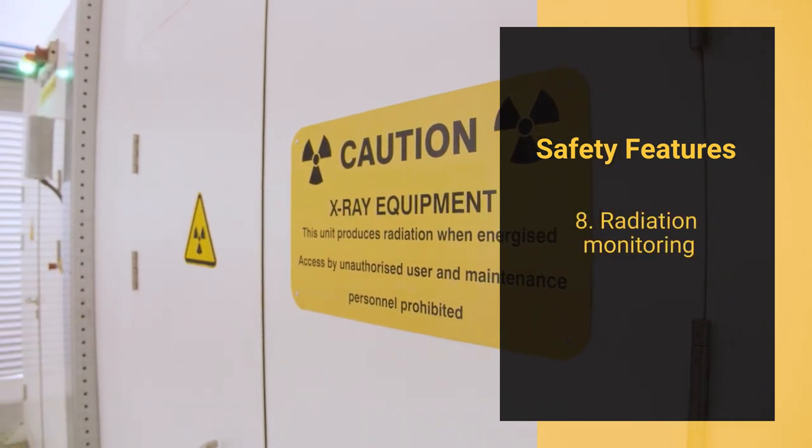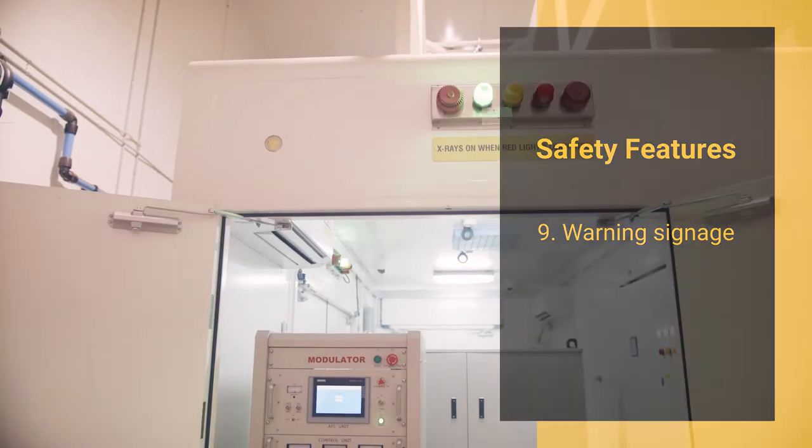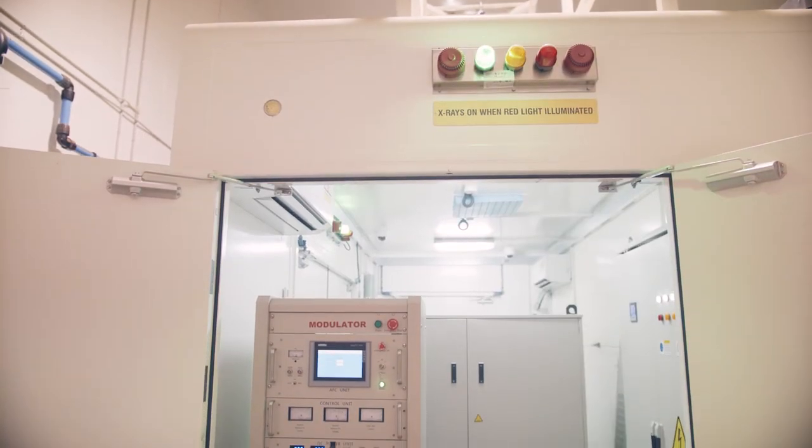The radiation area monitor, installed inside the LINAC cabin, actively monitors the dose rate in the area around the shielding block. The monitor automatically disarms the system if a higher than normal radiation dose is detected.